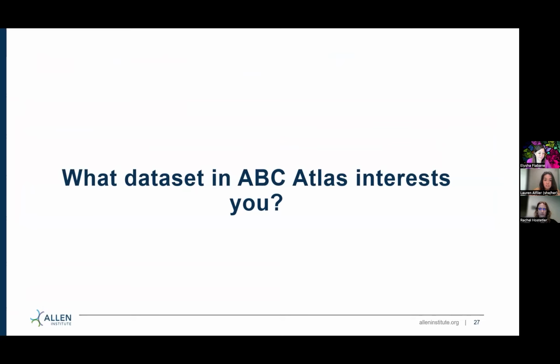We had a question: do you plan to expand your spatial transcriptomic data by adding sequencing-based spatial transcriptomic data? Also, do you plan on adding single nucleus RNA-seq data from the non-human primate brains to the ABC Atlas? Yeah, there are more data sets being added to the ABC Atlas in the future. I cannot give exact estimates on when they'll be added or which particular data sets, but there are a number of other projects going on at the Allen Institute that involve spatial transcriptomic data that will likely be added to the ABC Atlas in the future.